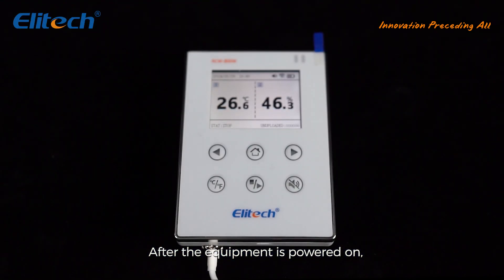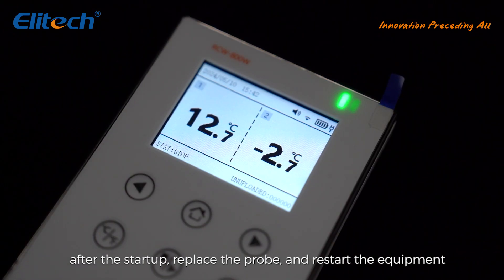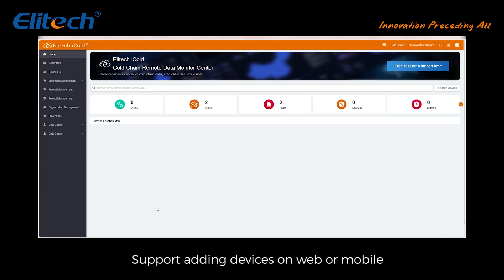After the equipment is powered on, it will automatically identify the type of connected sensor probe, supporting temperature and humidity probe and dual temperature probe. After startup, replace the probe and restart the equipment.